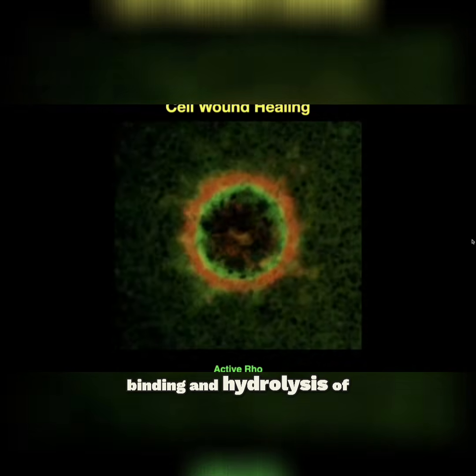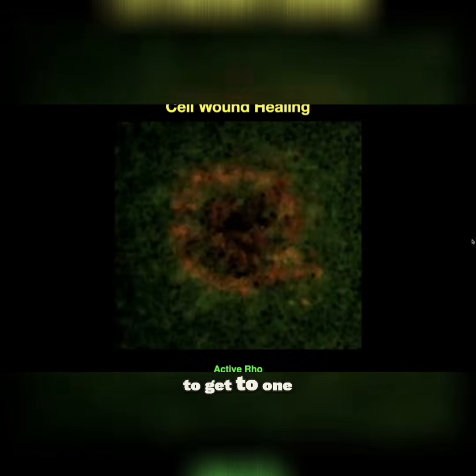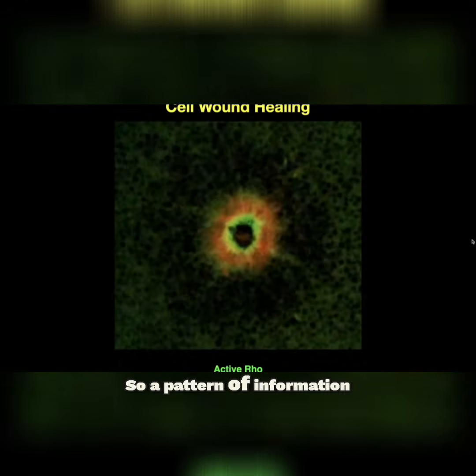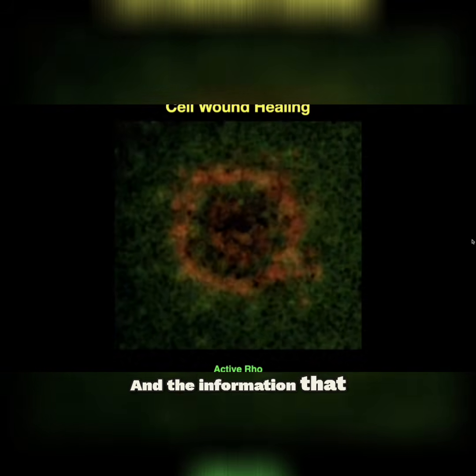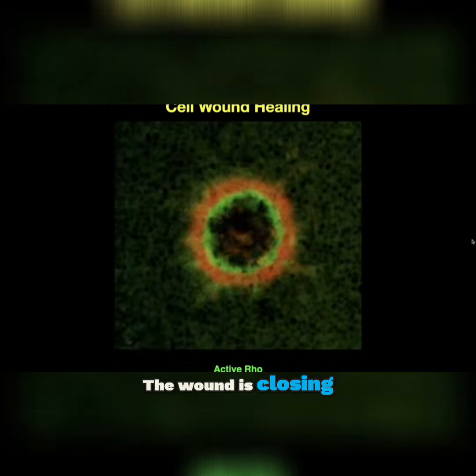We're looking at a cortical pattern of a protein called CDC42 and another protein called Rho. And these guys, like tubulin, bind to GTP, and they can hydrolyze GTP. So they go through a cycle of binding and hydrolysis of a nucleotide. But in this case, we tend to think of them as information molecules. We're seeing a pattern of information, and the information that they convey results in the accumulation of actin filaments and myosin around the wound. We can't see that in this movie, but you can see the consequence of their accumulation. The wound is closing.